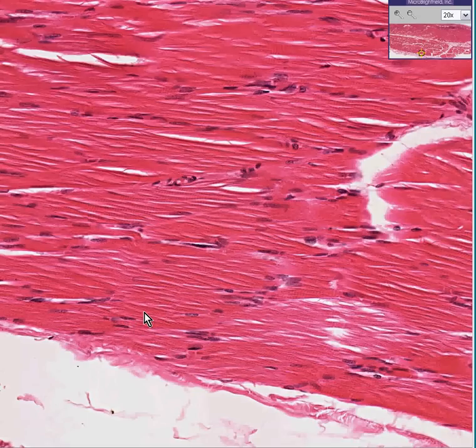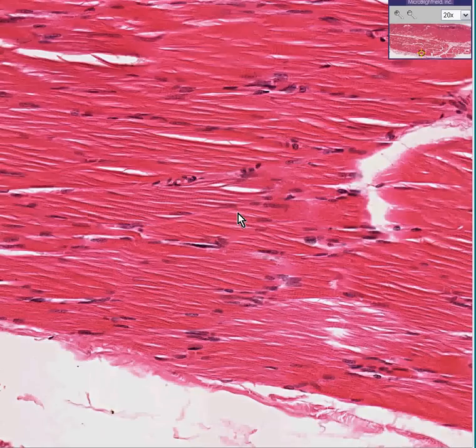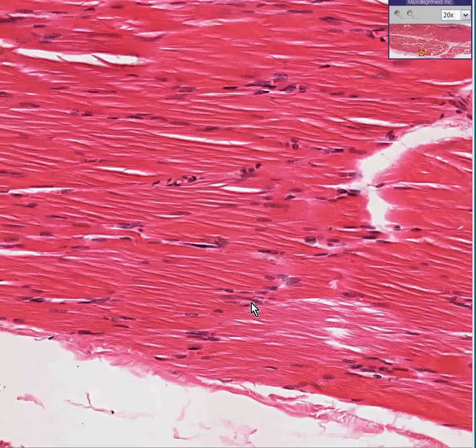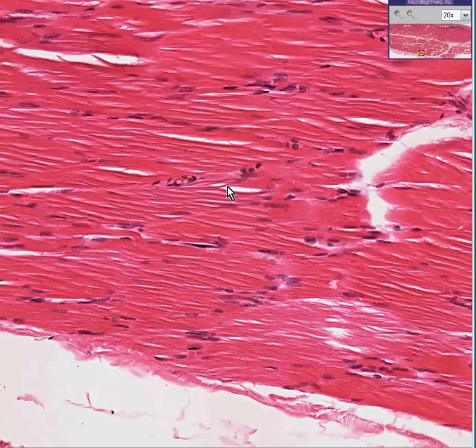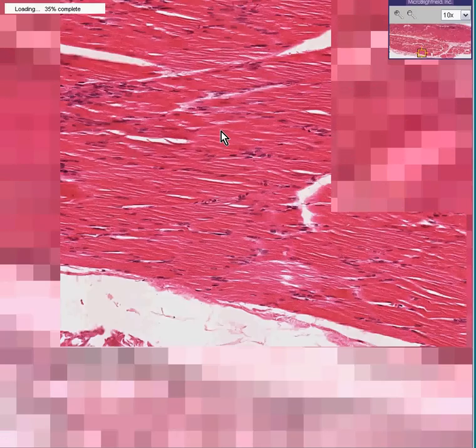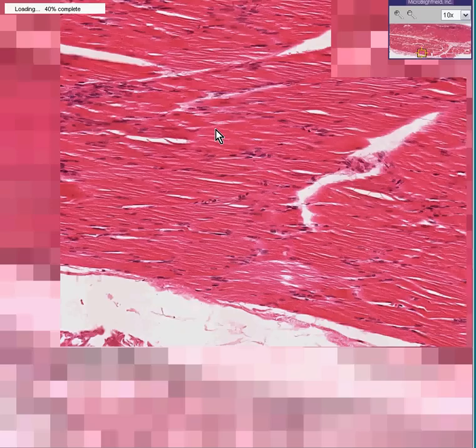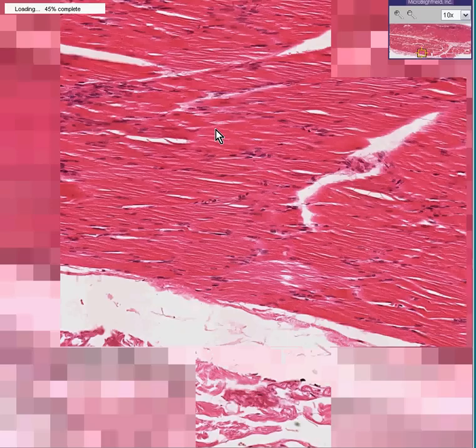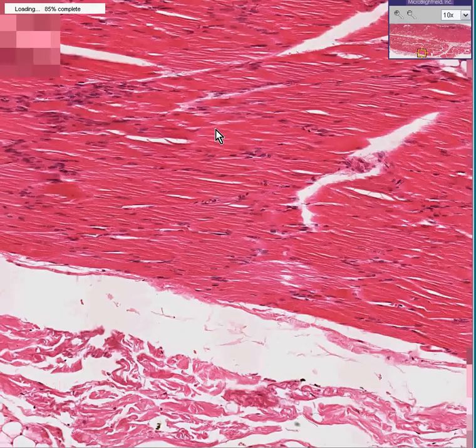The only thing you'll notice here is perhaps the fibers are not as thick as they usually are. Because of this, the connective tissue cells between the fibers look a little bit closer to each other. In other words, the nuclei of the cells and the connective tissue cells between the fibers look more numerous because, relatively speaking, the fibers are thinner. This is skeletal muscle atrophy — a neurogenic type of atrophy in which you have loss in the numbers and in the thicknesses of the skeletal muscle fibers.